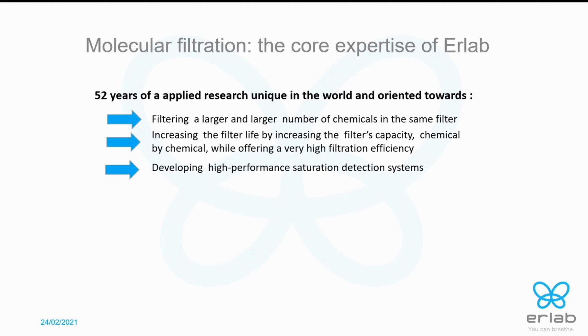Next to the filter itself, it's important to develop a high performance detection system. Our lab has been working on developing such a system for a very long time, and also to develop a remote safety control system.